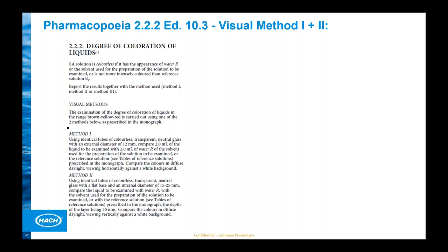So that means commissioning is, there's a document available so that all steps are documented on paper and can then be recorded on a paper record, and that's available, yes. And as we have seen, there are some standards necessary for these IQ-OQ. We have the test filter set, so the instrument will be tested during the qualification according to the manufacturer's specification, so we will check all important parameters on the instrument during the operational qualification.